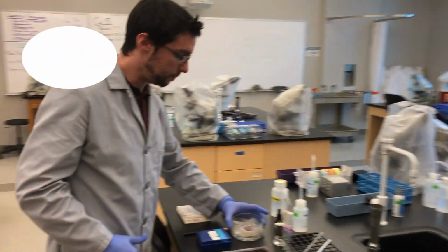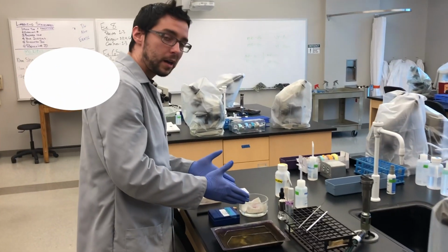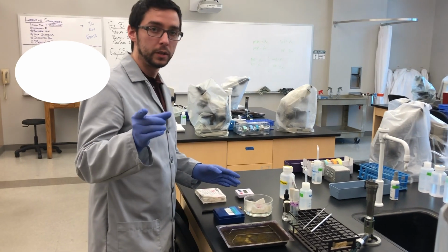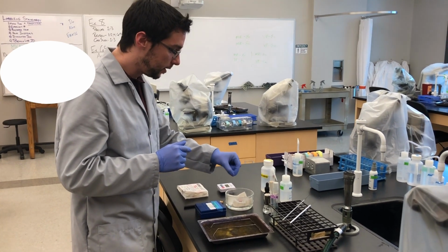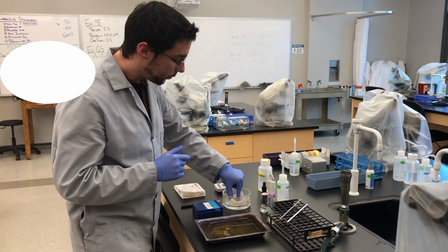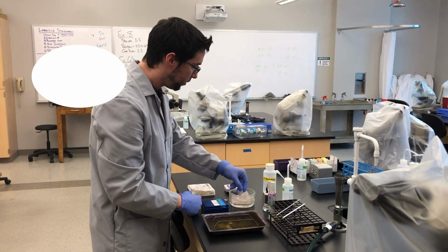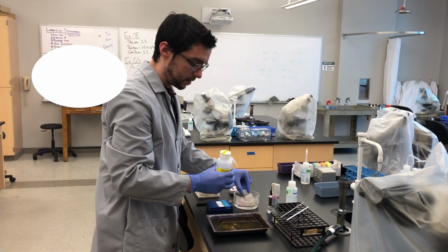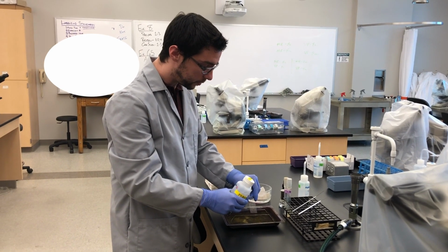So again, be very careful when you pull this out of the microwave. It shouldn't be hot enough to burn you, but be careful. We do have hot glass holders there, and also be very careful with your slide. So once you get your slide here, you're going to take your acid alcohol wash. Now why are we doing an acid alcohol wash?